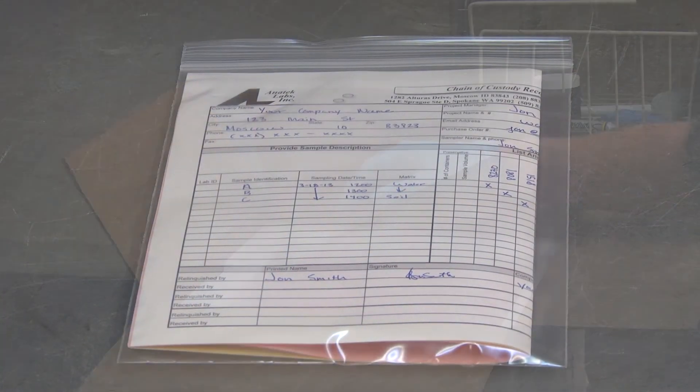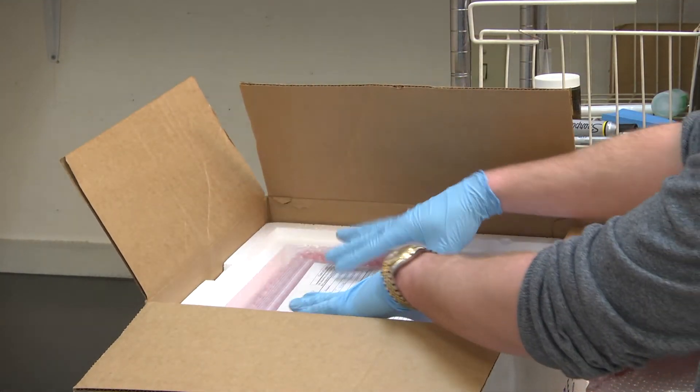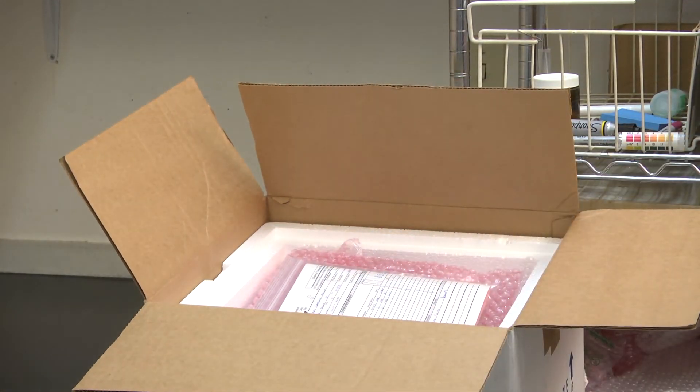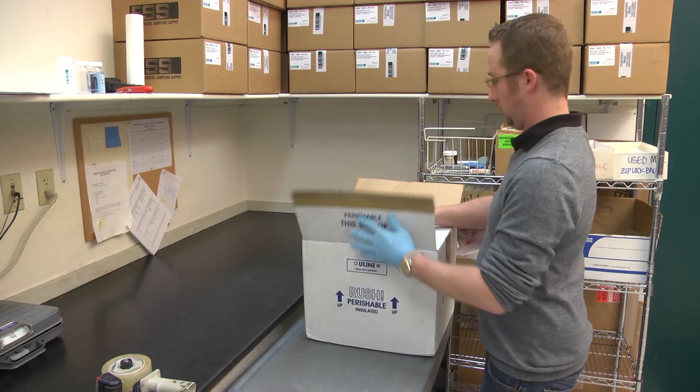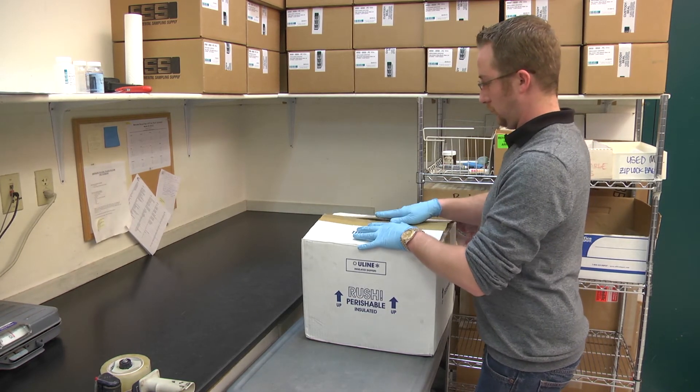Before sealing the cooler, be certain to include a copy of the chain of custody enclosed in a ziploc bag. Seal the cooler completely with tape around the lid and label for shipment to Anatec Labs.